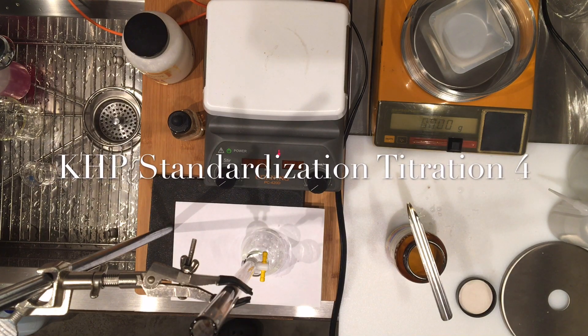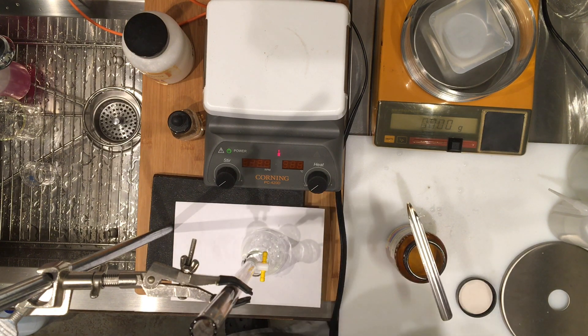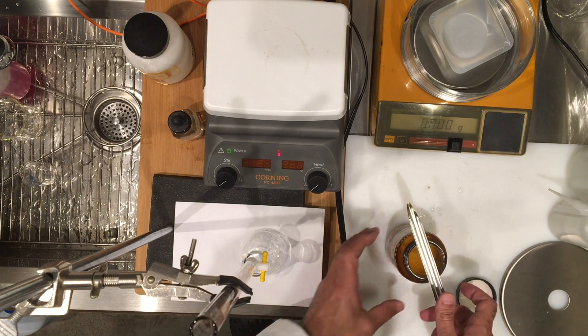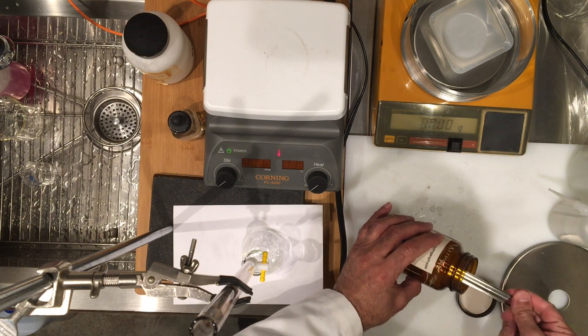It turns out that a fourth titration is necessary. Look at your calculations and see how the results for the second and third titration for molarity of sodium hydroxide are close to each other — in fact they're very close — and the first one is a little off. So I'm going to do a fourth titration and hope that the results are close to titrations 2 and 3. If that's the case, I will not be using titration 1 in my averaging of sodium hydroxide. But it all has to do with how well we do this titration trial, so I'm going to go ahead and weigh my sample again.